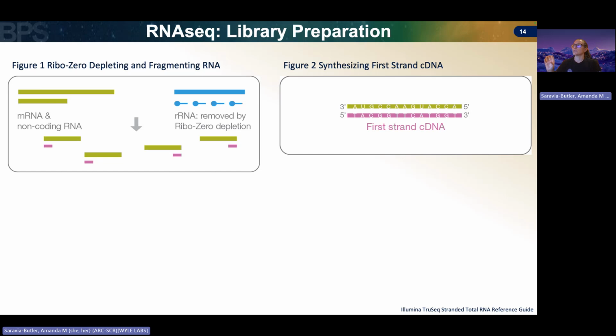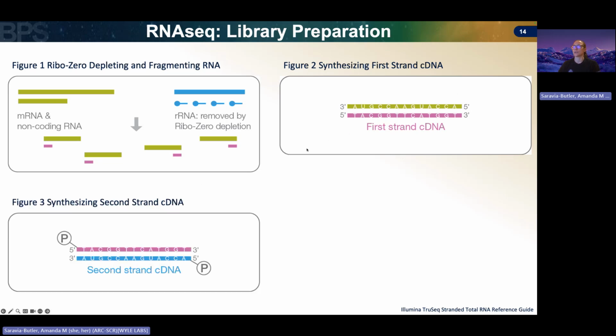And so we go ahead, use reverse transcriptase. It is using a random hexamer, so just a random sequence of 6 nucleotides, and it's supposed to be random because it's supposed to be priming at random locations within your total RNA here, to make sure that you transcribe all of the RNA in your sample. And so again, using reverse transcriptase, we make our complementary DNA from our initial RNA that came from our sample. Could be messenger, could be other types of non-coding RNAs.